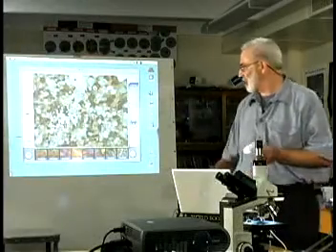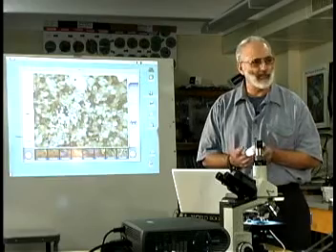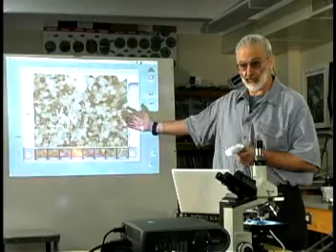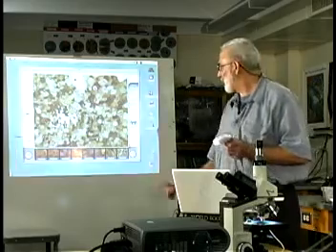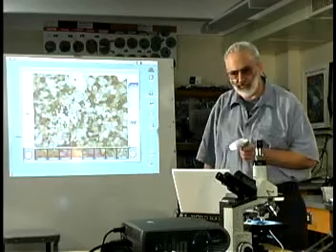In this particular picture, we don't have any shells or any signs of any biologic resources, nothing living. These are all sand samples. This particular sand sample is from Newport, Oregon. As we look at our sample, we can see several white and see-through structures, translucent. We can see definite shades in our yellows. We can go to darker oranges. We can go to browns and even blacks.